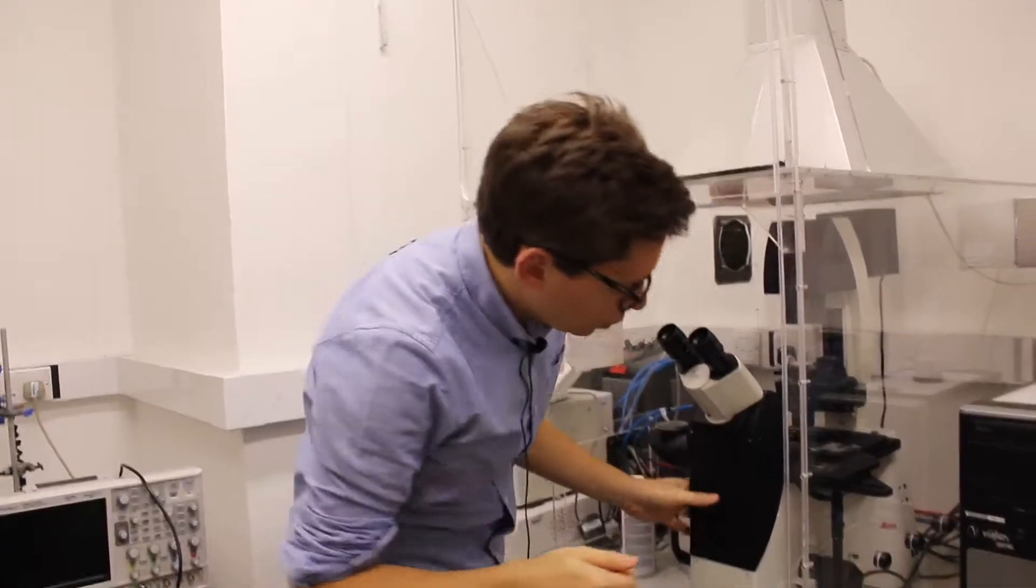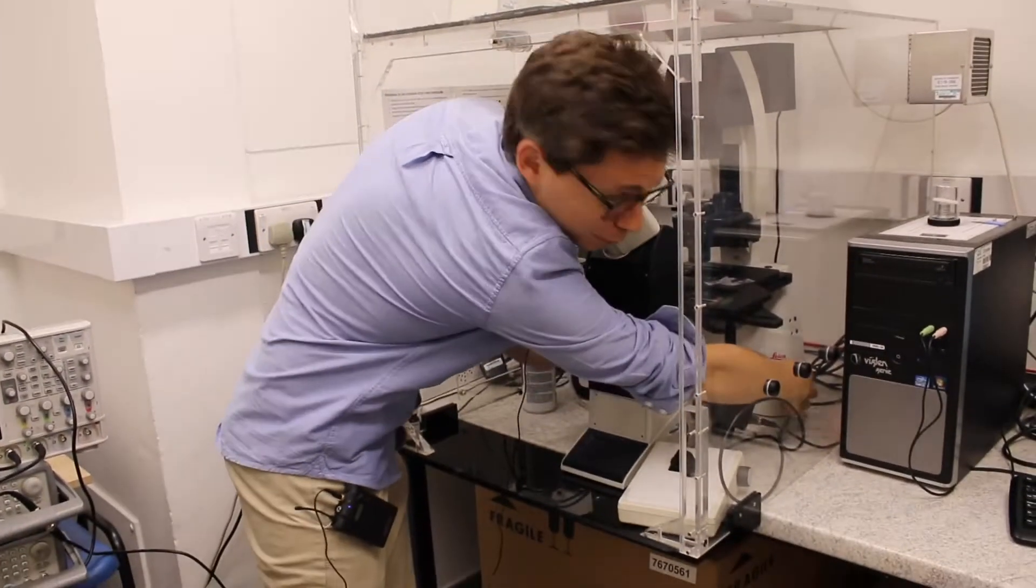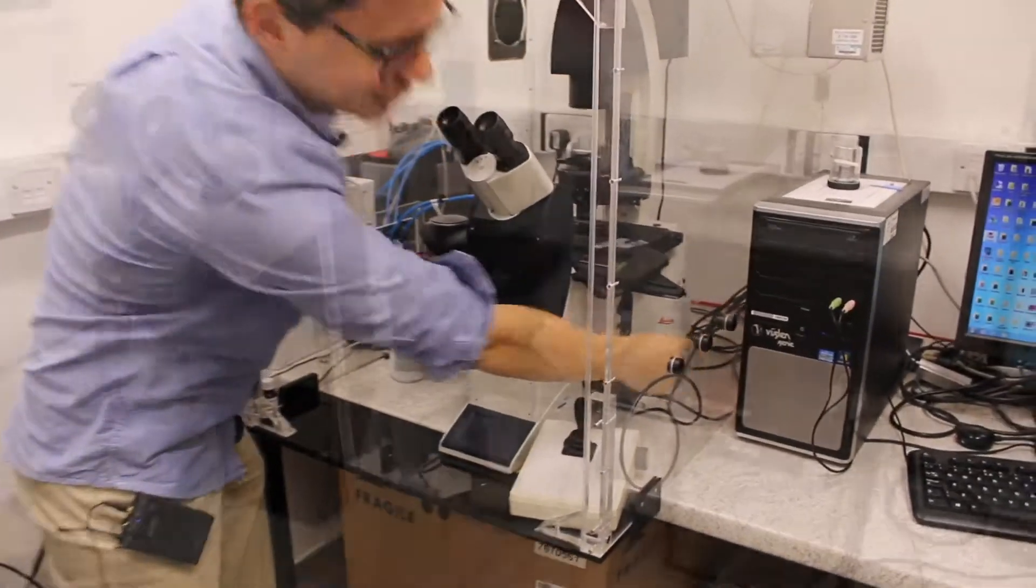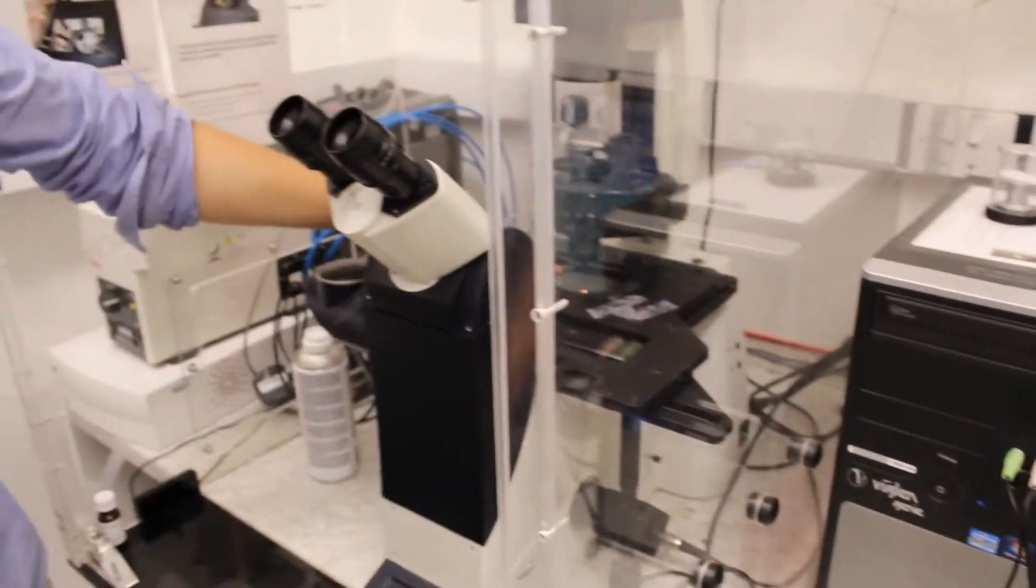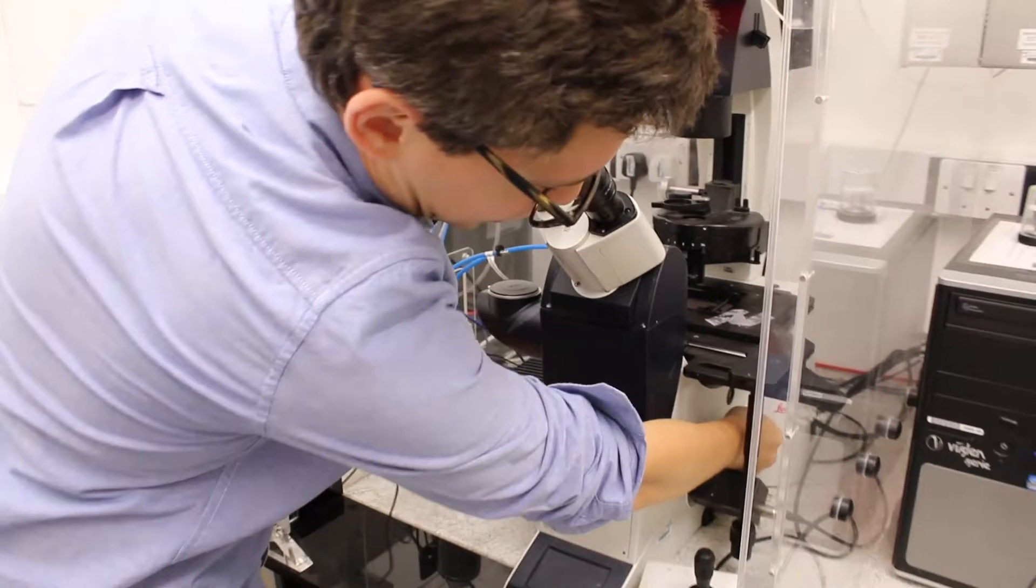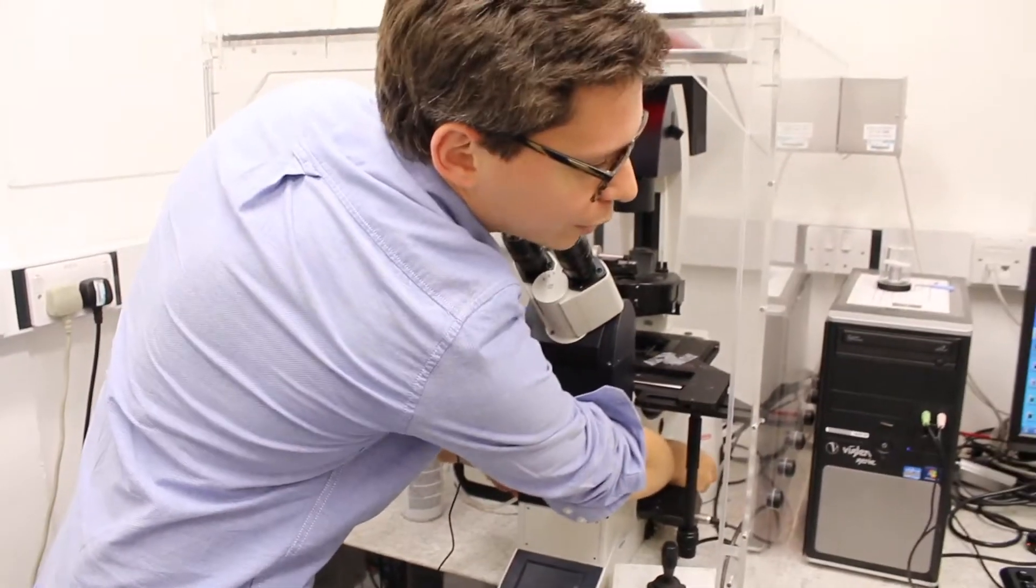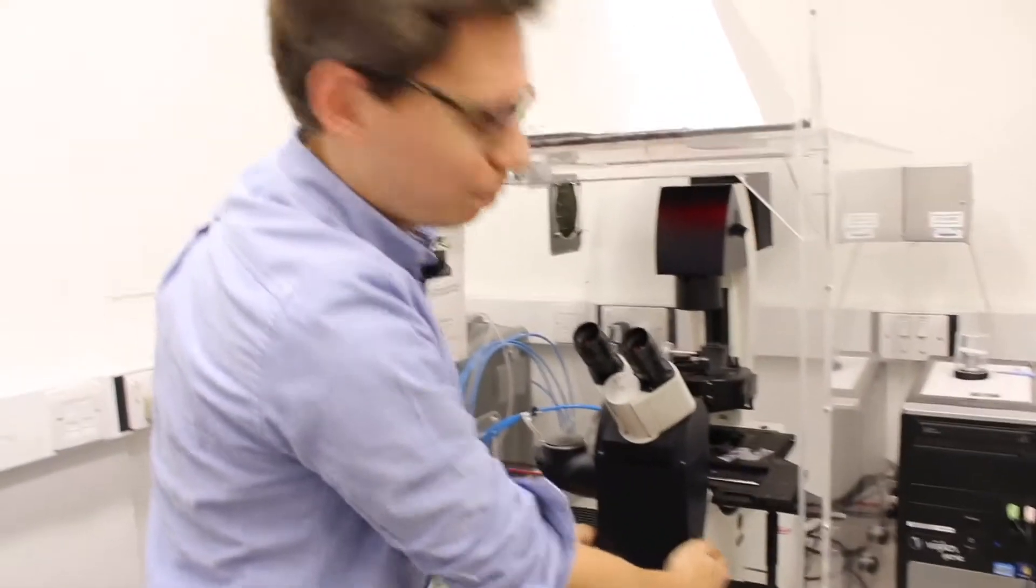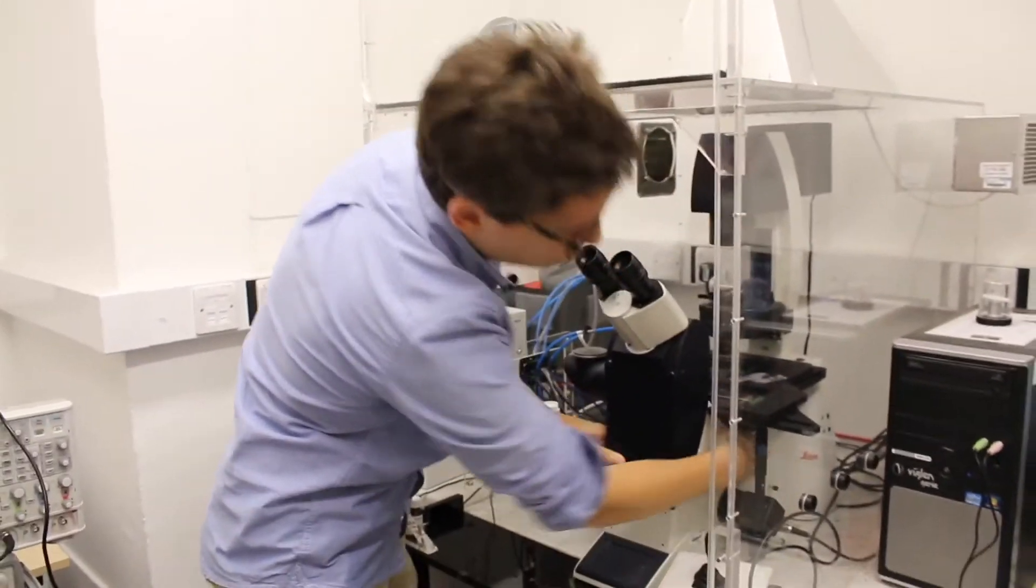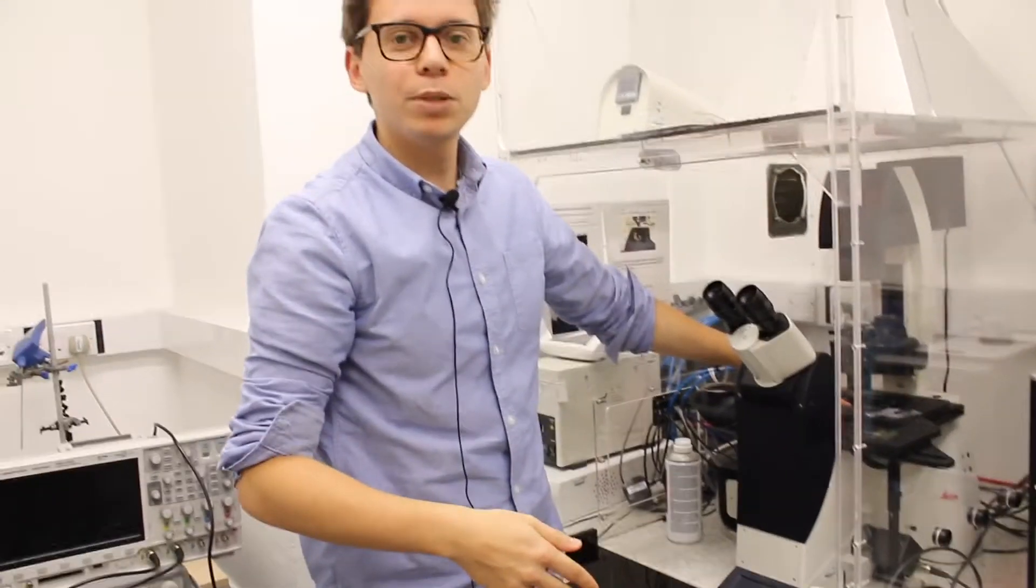You turn on the microscope first by using the button here. And then you will see light coming through. If this bit is in, if it's out, the light will go to the camera. So you need to press that in first to have the light going through the objective.